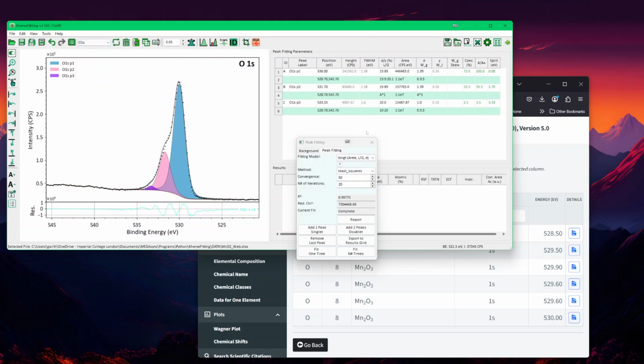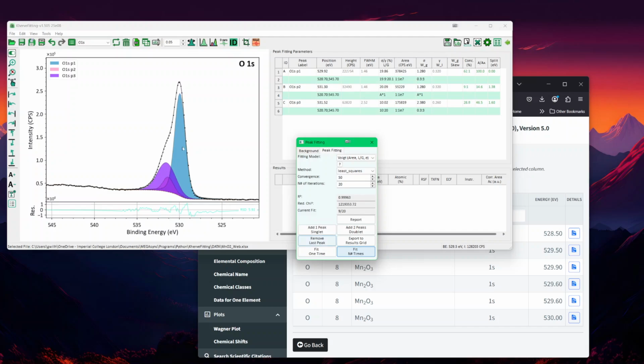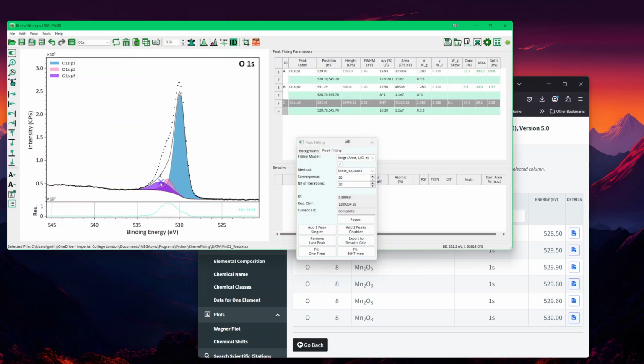So it's all in line with what we think. Now we fit this a second time, and we may disagree, because you can see that for oxygen it's very difficult to get something trustable. So I will tend to put it somewhere around here, and again that's too much, so I will avoid varying it to that level. 2.3 is a bit too much, so I may go to something like 2.